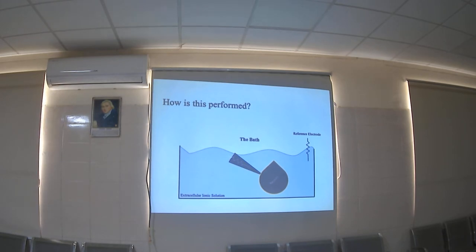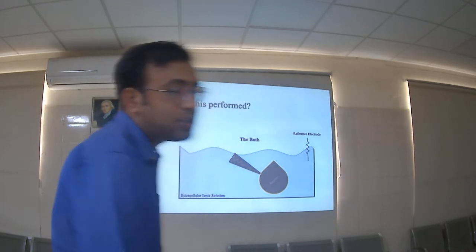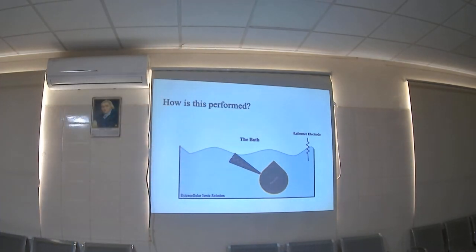जहाँ पे आप ion channel की functionality, ion channel को स्टडी आप कर सकते हैं, ठीक है? देखो, this technique can be, actually, this is a very tough technique, but you should get this lecture should give you an idea, because मुझे पता नहीं यहाँ पे इलेक्ट्रोफिजियोलॉजी सेटअप है कि नहीं, लेकिन आपको इलेक्ट्रोफिजियोलॉजी का पता होना चाहिए, क्योंकि it's a very controlled experiment.